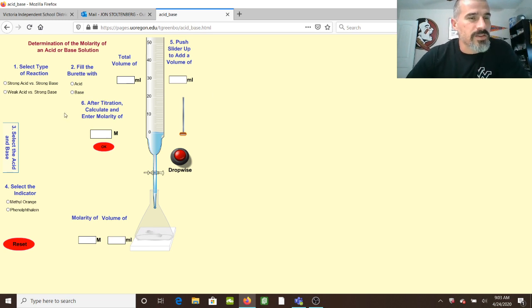All right, so first things first, you're going to select your type of reaction. All of my classes are going to do strong acid versus strong base. So I'm going to click that.